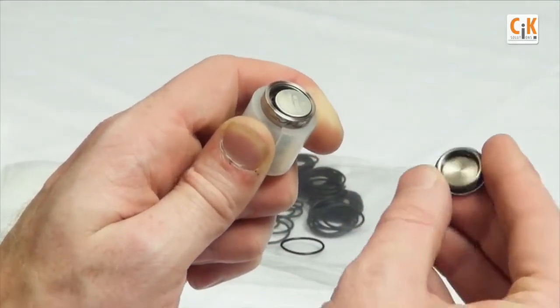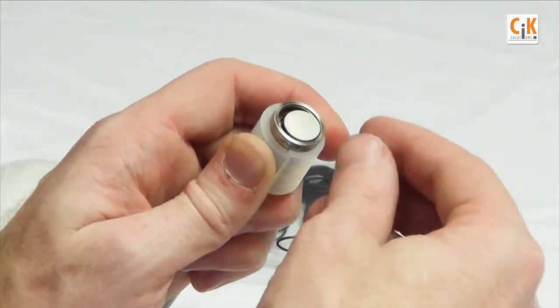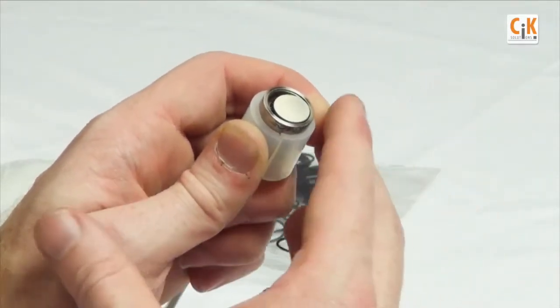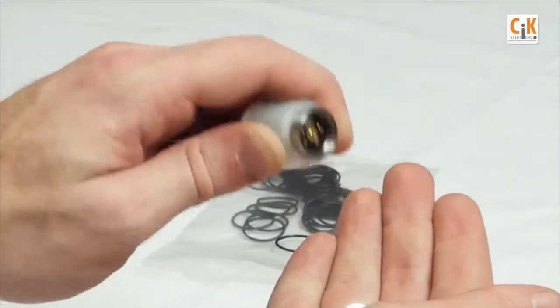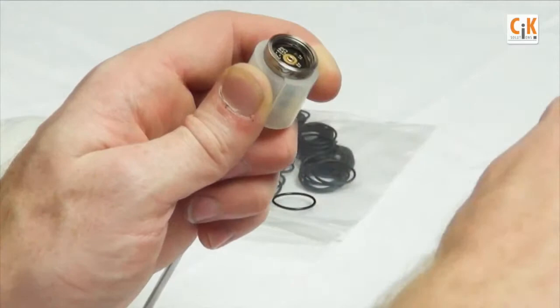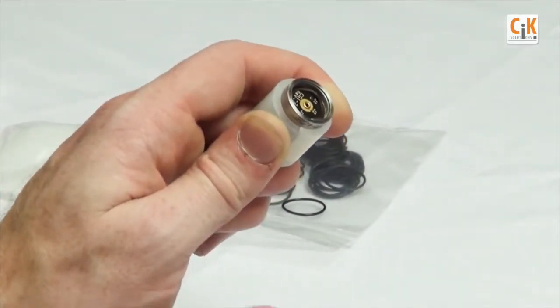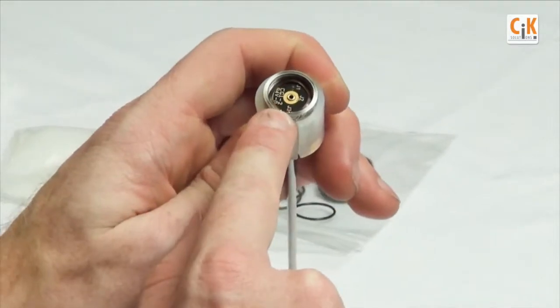Remove the old battery by tipping the logger on its side until the battery falls out. Dispose of the battery appropriately per local regulations. Examine the battery compartment here in the logger and the cap.